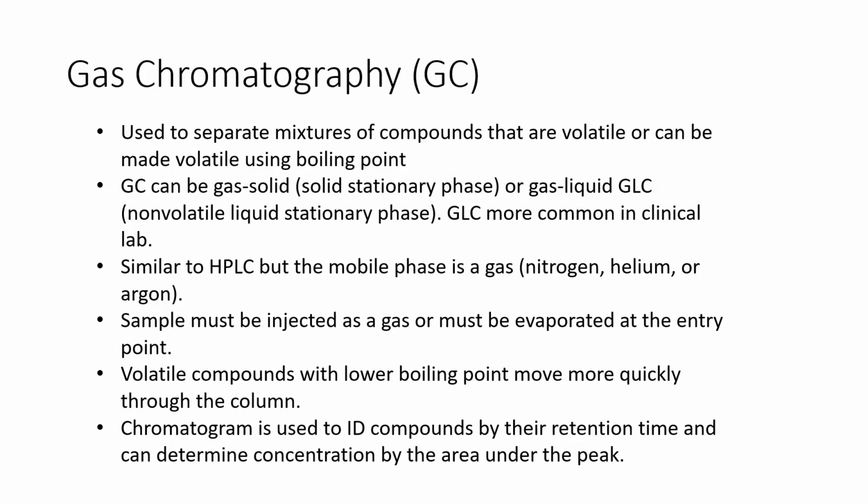Gas chromatography is used to separate mixtures of compounds that are volatile or can be made volatile, and it uses boiling point. So volatile means that it can be turned into a gas or can evaporate.